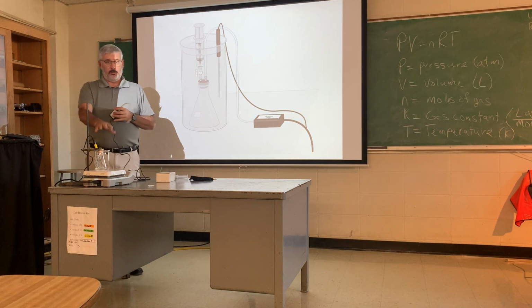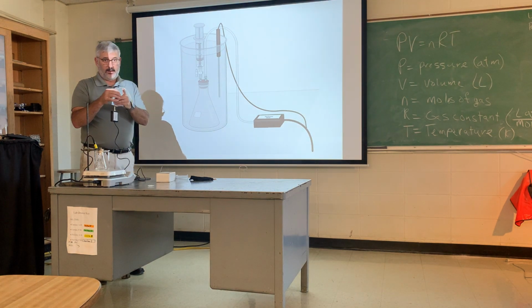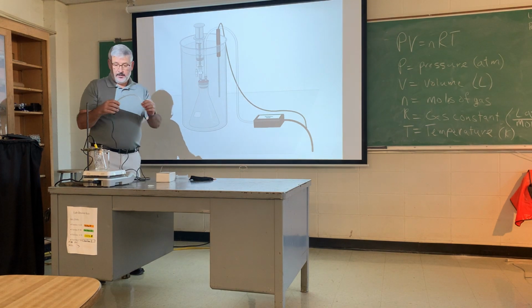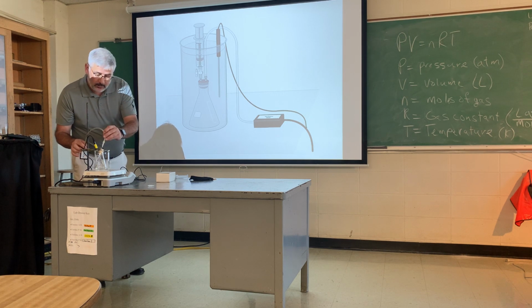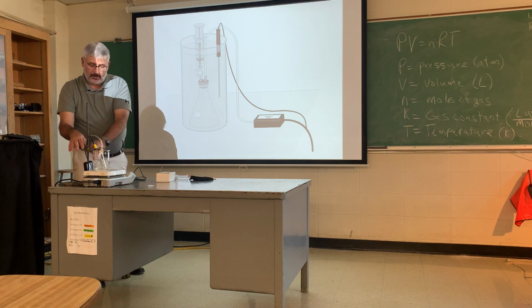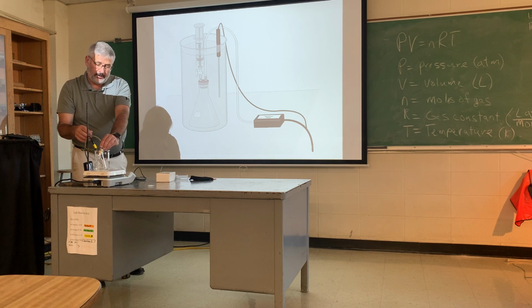Now, we're going to be using a hot plate, and the plastic cords and tubing don't get along well with the hot plate. They melt, and then we have to do repairs. So be cautious when you're setting this up to, number one, make sure that your pressure sensor, tubing, and cables are away from the hot plate. I usually go around the stand and use the clamp to hold those back. And then you'll plug that in.